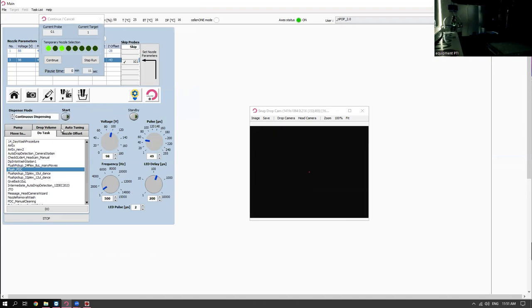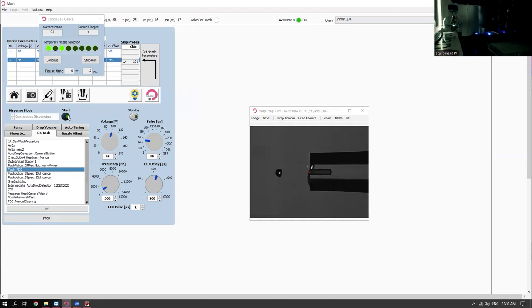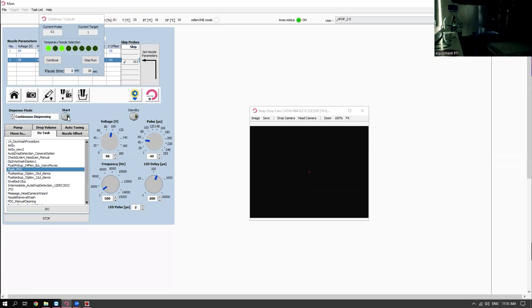Could say that typically if you have a large volume of fluid here, if it's being disturbed at all by the droplet that's coming out, then you're going to want to wipe it off. And you're probably going to want to clean the nozzle a little bit just to make sure that it's not going to disturb the dispense. But it looks like this droplet on the face of the nozzle isn't actually near the orifice. It's not being affected by the droplet generation. So I like what I see.